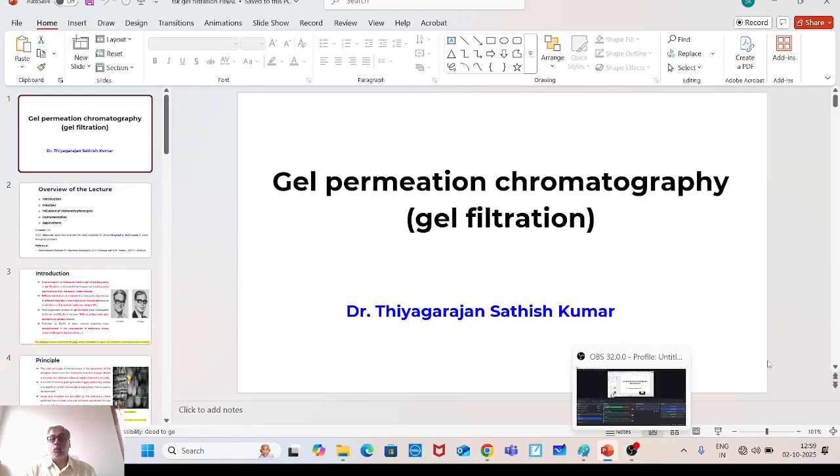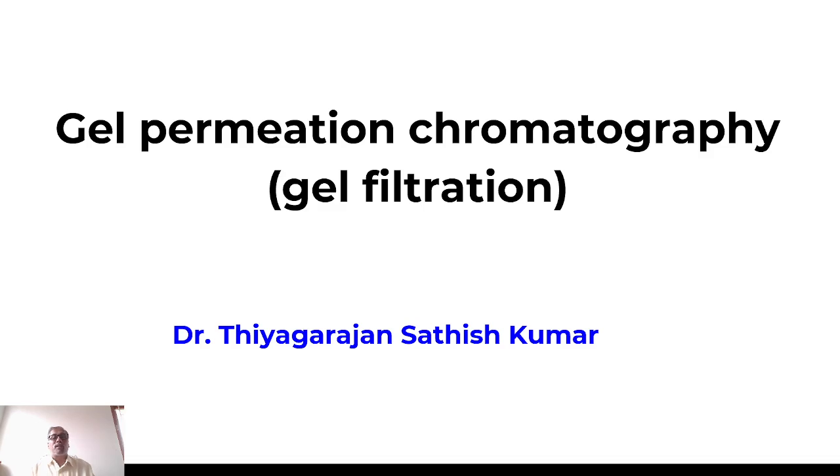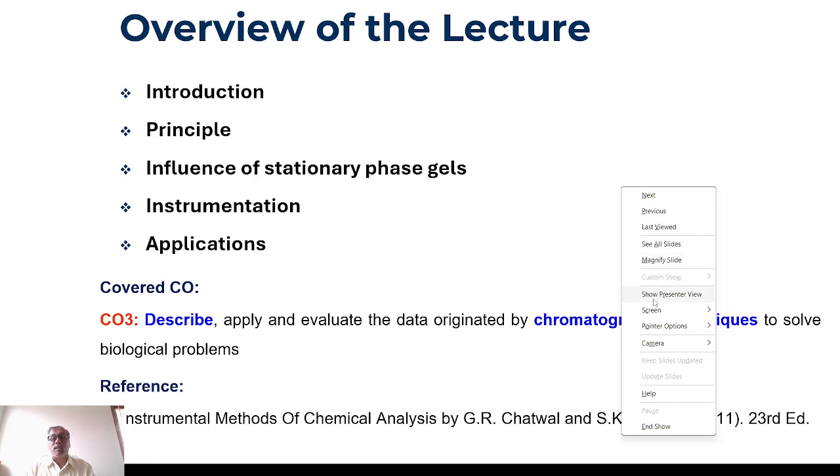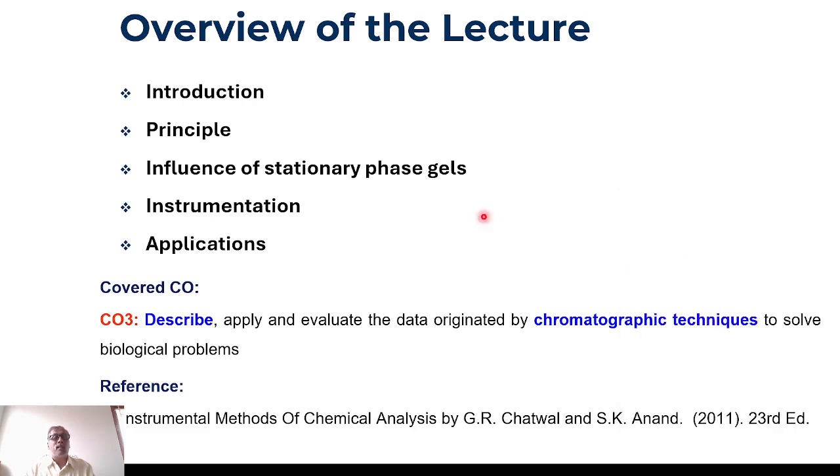Hello friends, good morning. I am going to discuss the theoretical background, principle, instrumentation and finest applications of gel filtration or gel permeation chromatography. In my lecture, I will be introducing the technique, and then I will be discussing the principle, the influence of stationary phase gels, how we have to set up this experiment, and finally the applications of gel filtration.